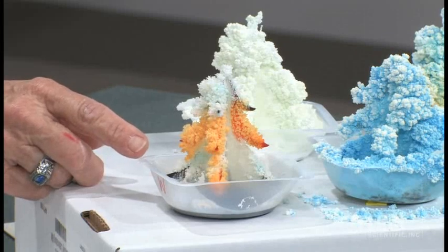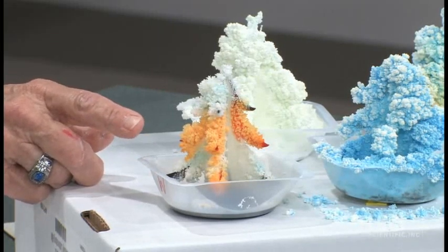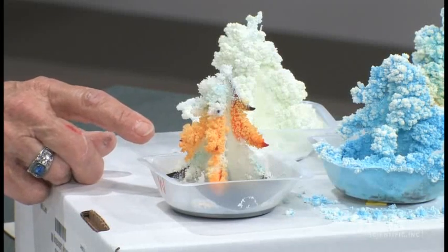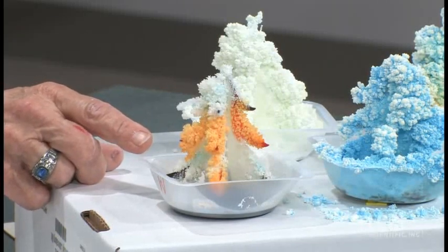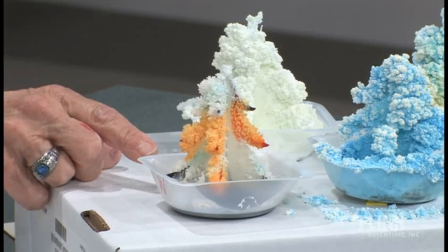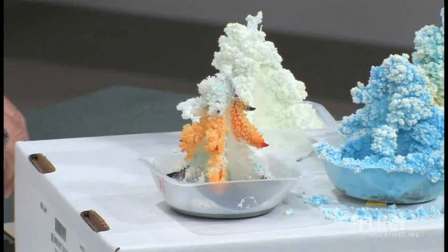That gives you an idea of how quickly this grows. In order for these crystals to grow, the liquid has to evaporate. I will warn you that if you're in an extremely humid climate, or if your laboratory is not particularly dry, that the growth will be impeded. But if you're in a nice dry room, then the crystal growth is going to be enhanced.